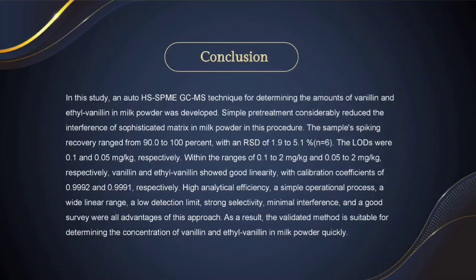The LODs were 0.1 and 0.05 mg/kg respectively, within the range of 0.1 to 2 mg/kg and 0.05 to 2 mg/kg.